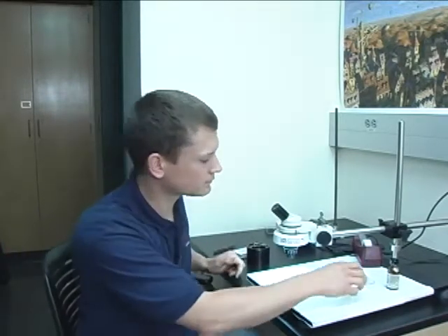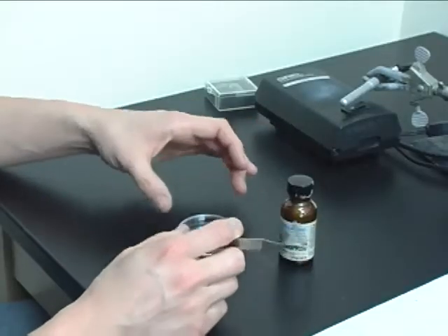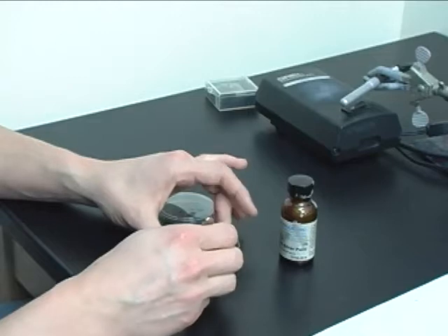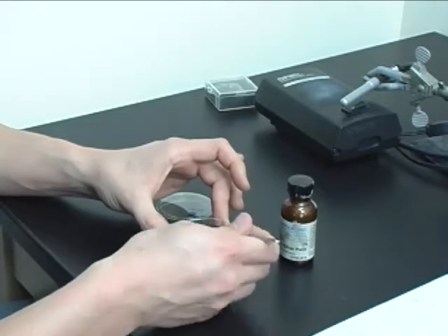So the first thing that we're going to do is we're going to prepare our sample. Our sample in this case is indium tin oxide, which is a conducting transparent metal oxide.